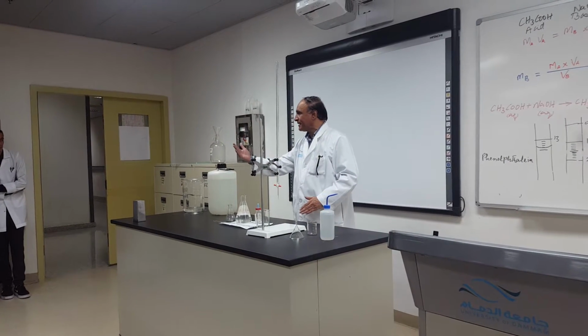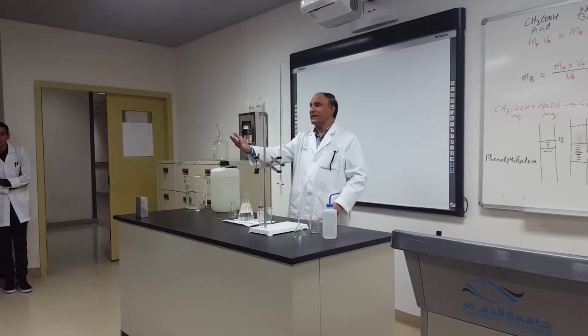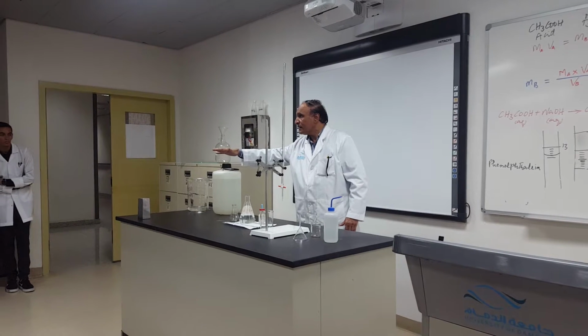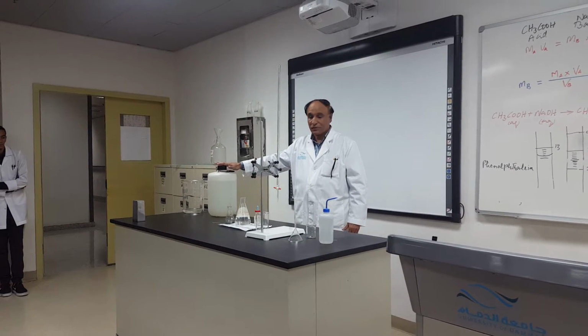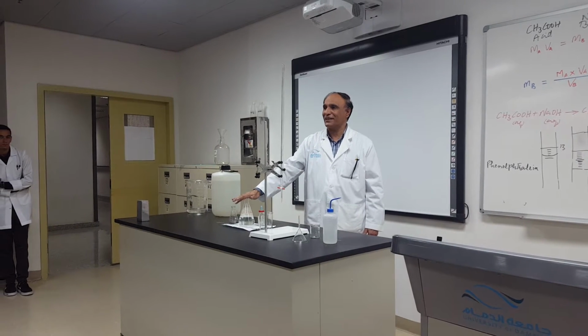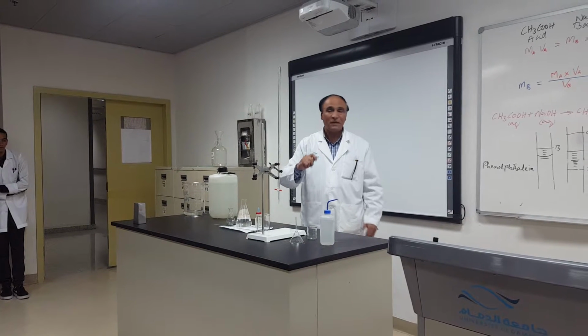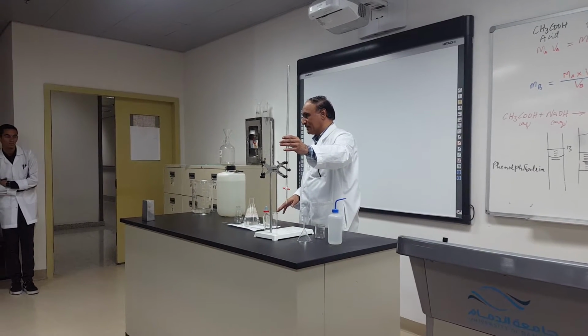You have a standard, so we can find the other with the standard. We want to know the concentration of this, so we know the concentration of the other. And this we can do by doing the titration.